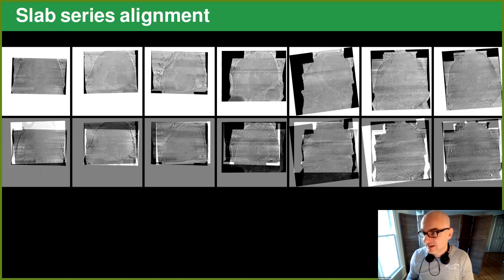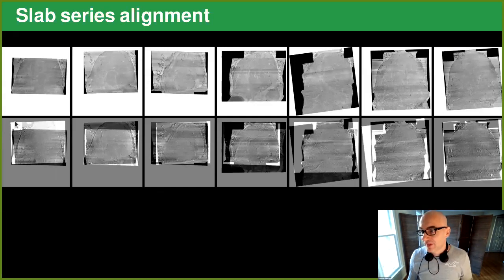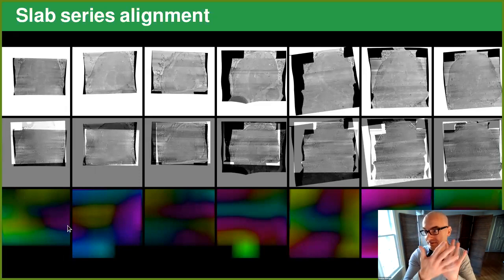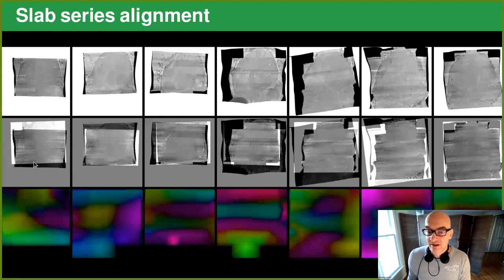We first identify just one affine model for each of these transitions. So we zoom out very far and use, again, SIFT features to find this with the consensus model. And then we subdivide this in smaller regions and do exactly the same thing again. So we subdivide this into 5 times 5 subregions. Again, these are still large images of thousands of pixels square, extract the SIFT features, find consensus models, and then map these consensus models into an interpolated deformation field. And you see here the difference of this deformation field compared to the previous affine model, right? So you only see the non-linear part of it. Okay, and then we further subdivide this, and then we further subdivide this, and then we further subdivide this.